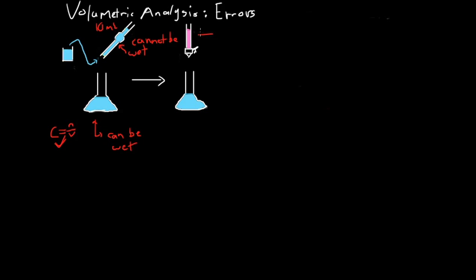Another error is if the burette is wet before we add the solution to it. That's going to dilute the solution, and we need a certain number of moles to be dropped into the conical flask for the reaction to reach the equivalence point. The number of moles required is constant, so if the burette solution is diluted, we're going to have to release a larger volume of solution to deliver the needed moles. So if the burette is wet before we fill it, our titer is going to be larger. So the burette can't be wet.